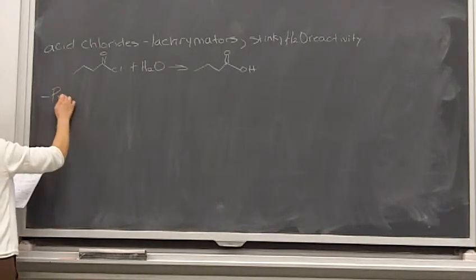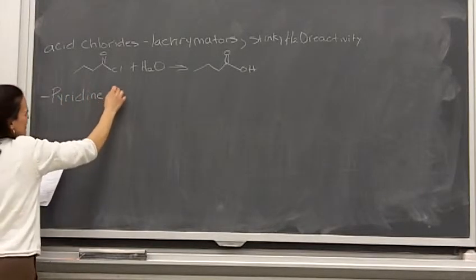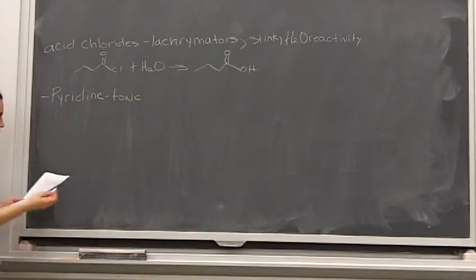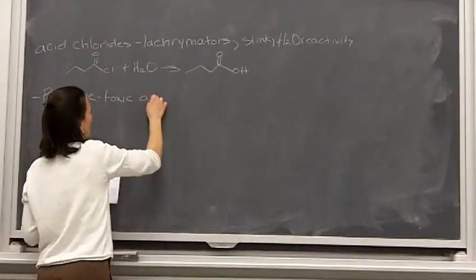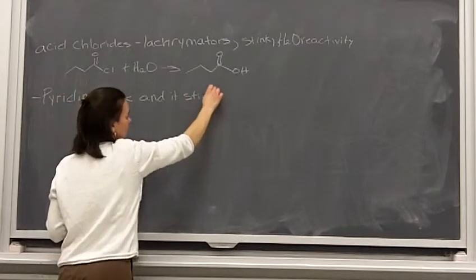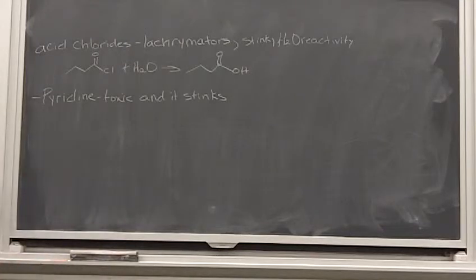Pyridine is not the greatest thing either, okay? It's a toxic chemical. You don't want to ingest it, okay? And it stinks too. So keep it in the hood. Wear gloves. Be careful how you handle it. It can also react with water as well, so you don't want it to get wet. And then make sure you contain any of its stinky garbage.